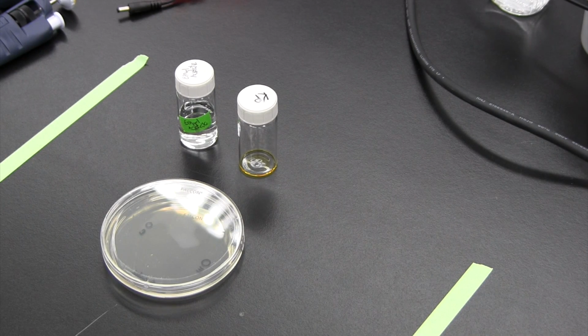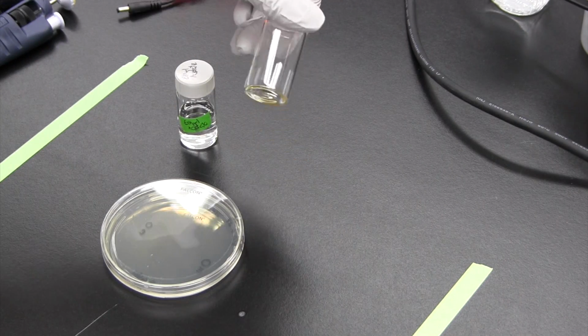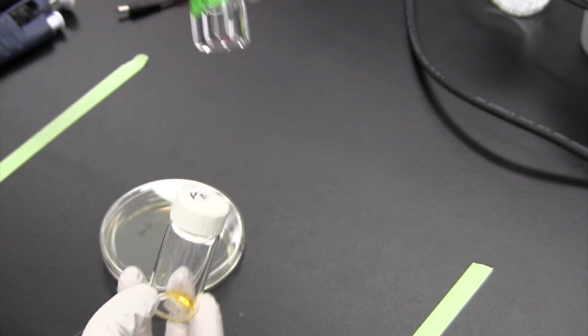And we are here to finish up the last stage of our chemical extraction procedure. In this stage, we've gone through cutting up the agar, extracting with ethyl acetate, and then letting it dry down. We had a dried extract that we showed you in the last video, and all we've done now is resuspend this extract with 100 microliters of ethyl acetate.